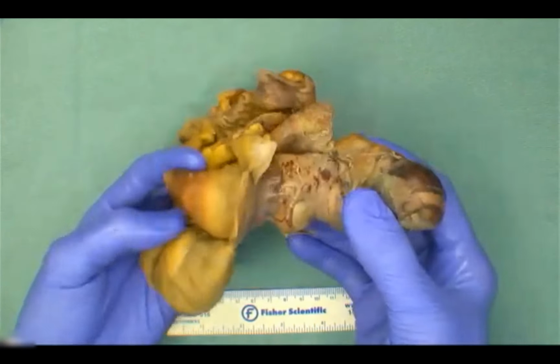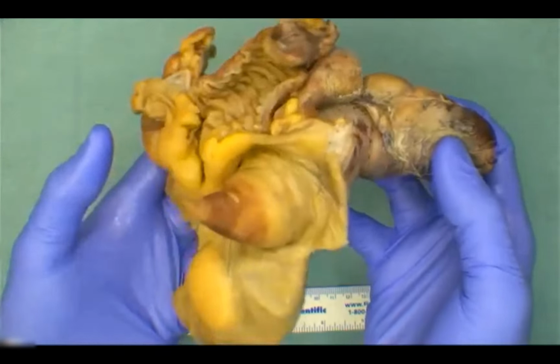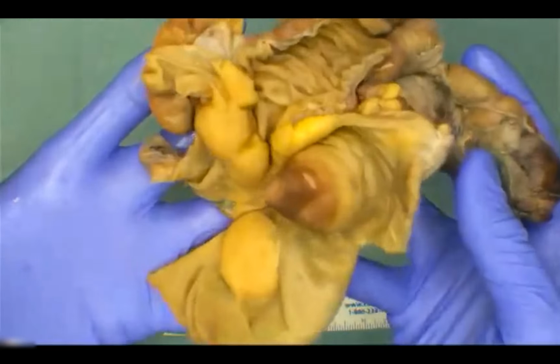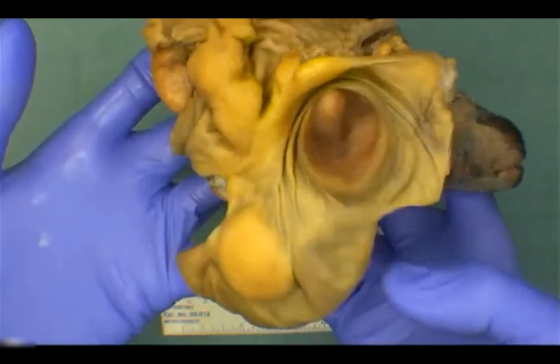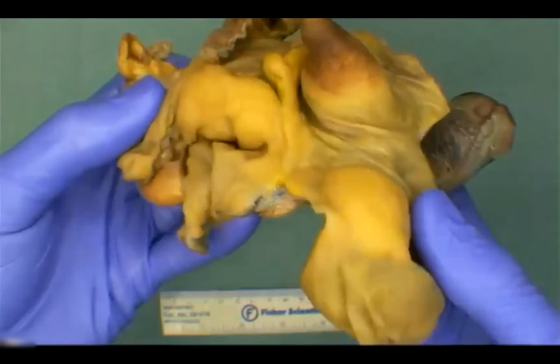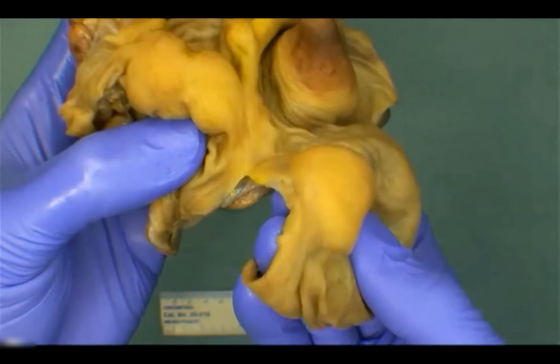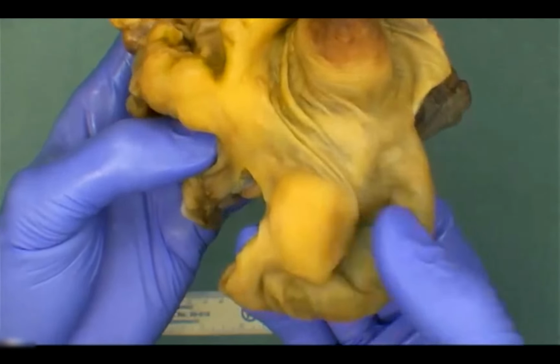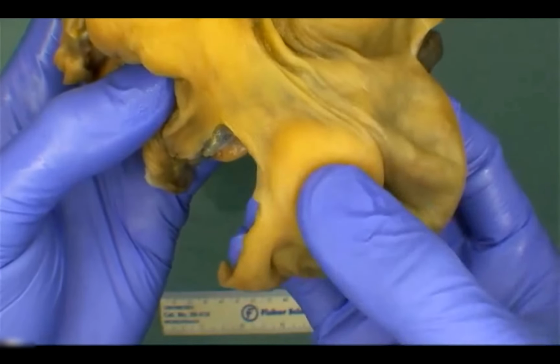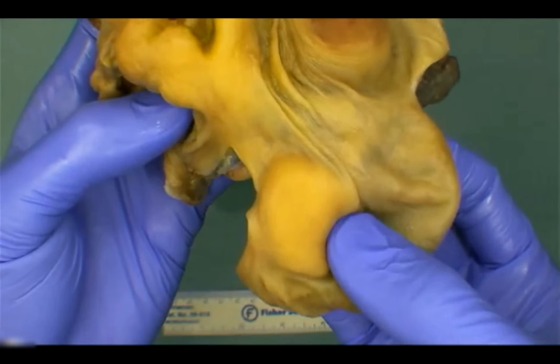When it comes to grossing, our eyes are very much drawn to this appendiceal pathology, but we always want to be aware that there could be secondary pathologies or secondary findings in our specimen. I don't know if you can appreciate, but if you can see something else going on the mucosal side, and that's a little bit intentional about not showing it, can anybody pinpoint what's happening with the mucosa here? Any thoughts on what's happening here? Yeah, okay, so we've got some type of a submucosal mass. It's got this kind of golden yellow color, which is not coming across well to the camera.